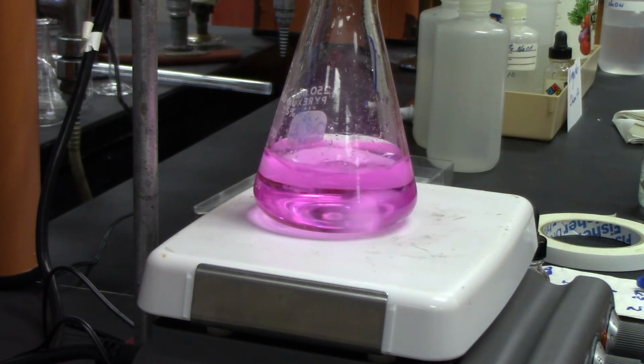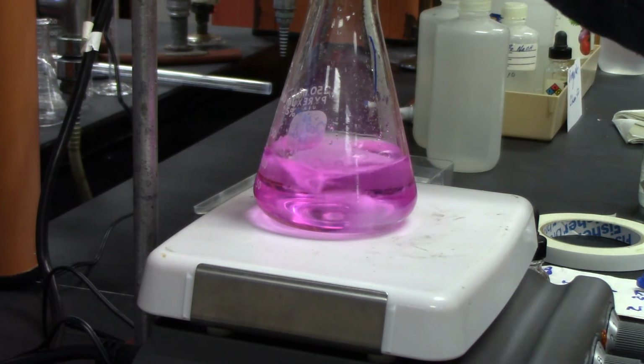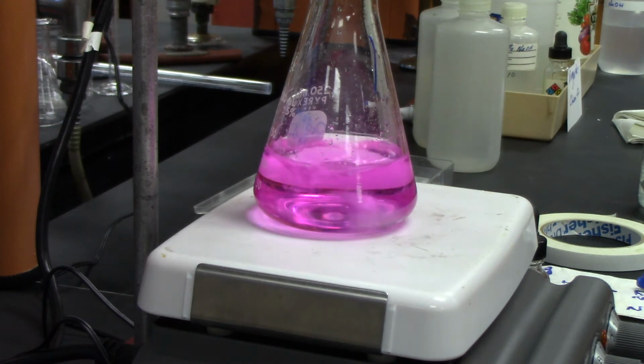Okay, I think we're there. I'm probably gonna have to add maybe another drop or two. Oops. All right, now record that value, and that value is 46.99. Okay.